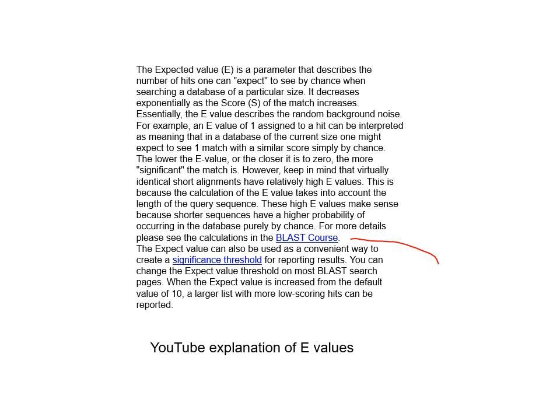And there you can add no significance to that particular match. If you get a match that's close to 0, that tells you that that's a significant match. That didn't happen by chance, and you can put significance to that. You can count on that being your unknown algae type, for example.